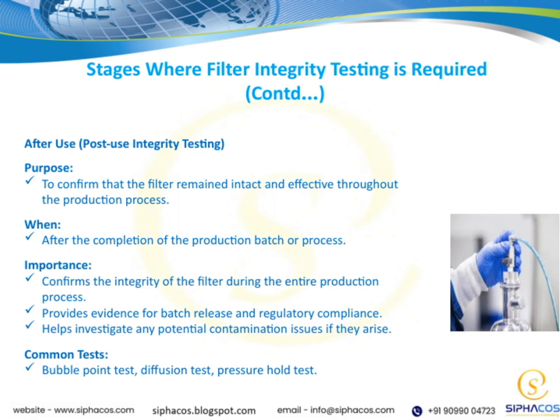This step is vital not only for ensuring quality, but also for providing evidence needed for batch release and regulatory compliance, giving confidence to all stakeholders involved. In addition, if any contamination issues arise, post-use testing helps us investigate and pinpoint potential problems with the filter. Some of the common tests used at this stage include the bubble point test, diffusion test, and pressure hold test. These tests are designed to thoroughly check the filter's integrity and ensure it performed as expected throughout the process.